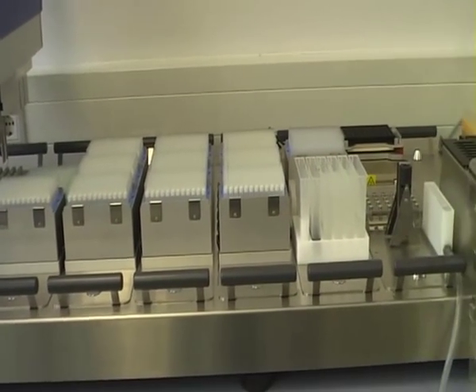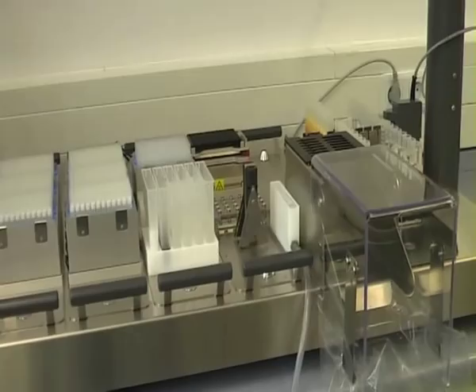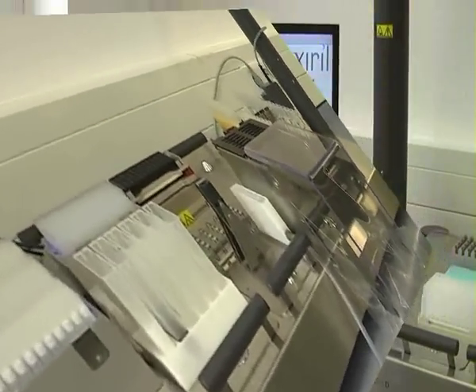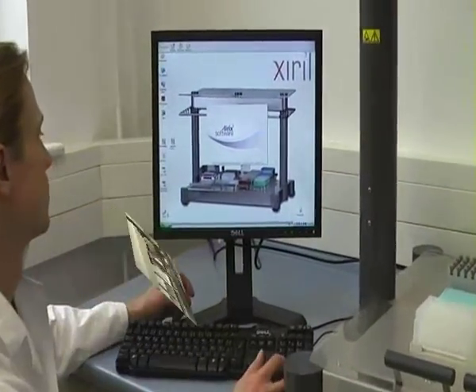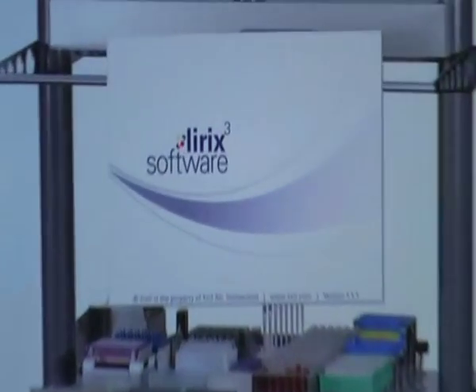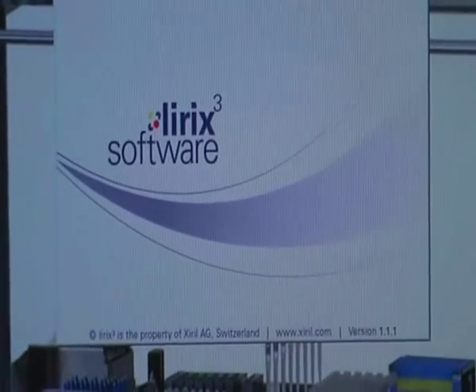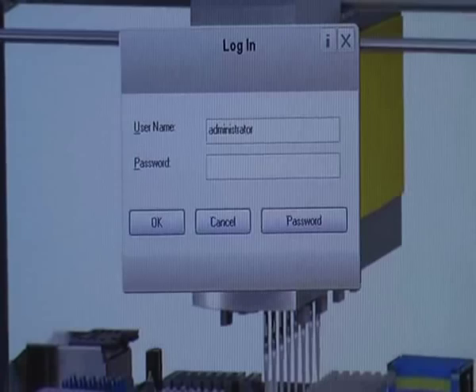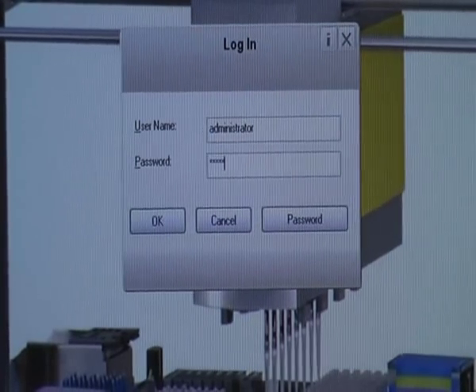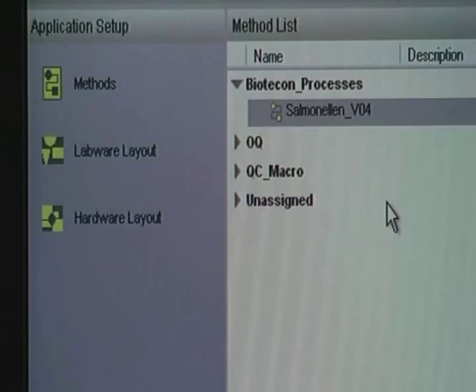The automation protocol starts after the food samples have been enriched, usually for 18 to 20 hours. No subcultivation is necessary. The user must first initialize the corresponding lirix software. After logging in, the Salmonella protocol is chosen from the method list.